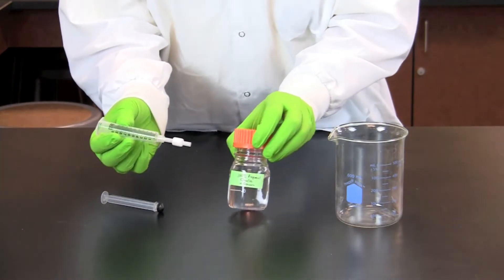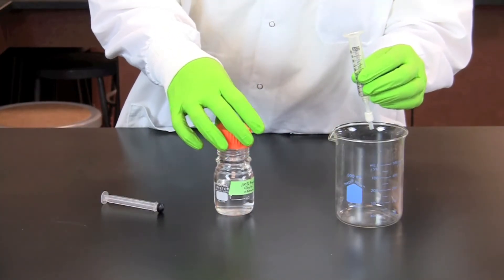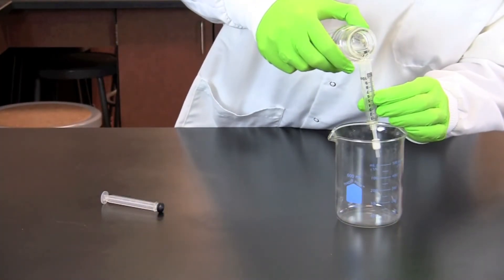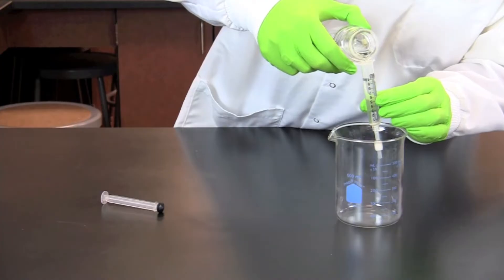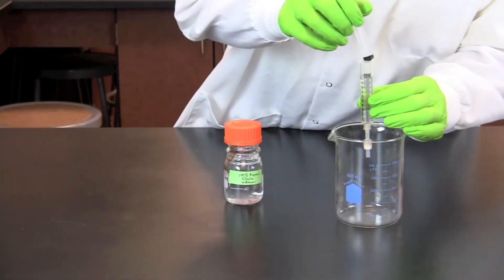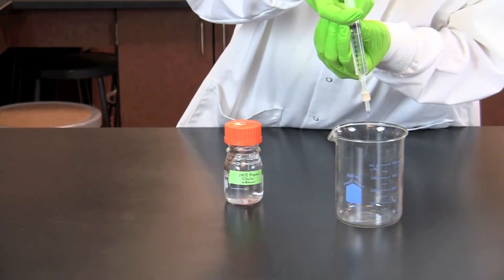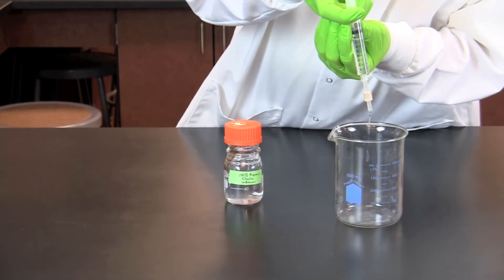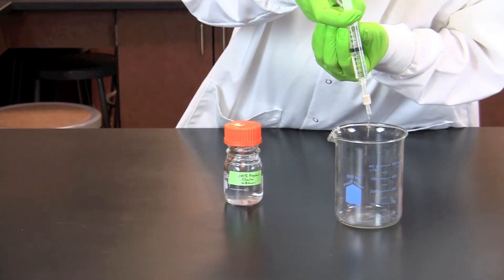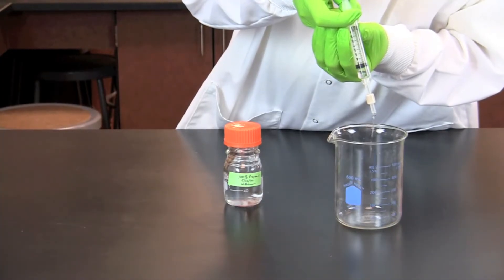Pre-wet the cartridge by pouring 10 ml of concentrated 2-propanol into the syringe. Attach the plunger and gently push the concentrated alcohol through the cartridge into the waste beaker. Make sure to push the concentrated alcohol through the column slowly so that it exits the syringe in fast droplets rather than in a continuous stream.